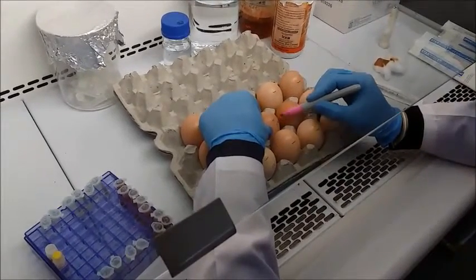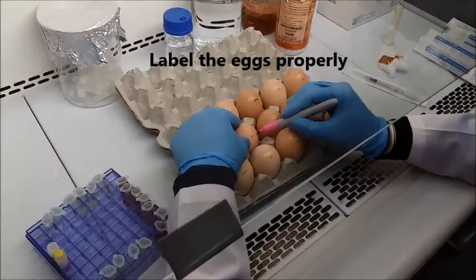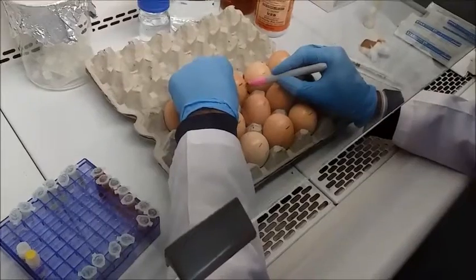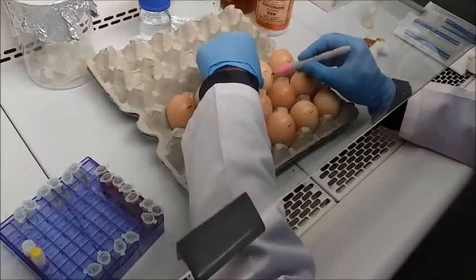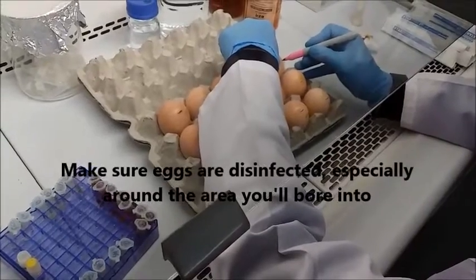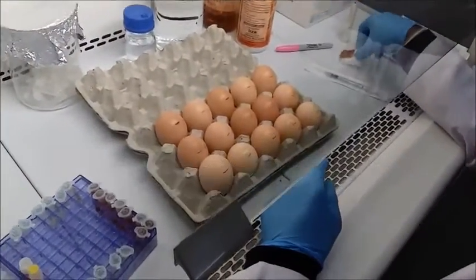So Dr. Muzaffar, as you can see, is marking the eggs in accordance to the samples he needs to inoculate them with. Okay, another thing that you need to do is that you need to disinfect the whole egg. So that's why Dr. Muzaffar has applied a layer of iodine on top of the eggs surrounding the air sac mark.